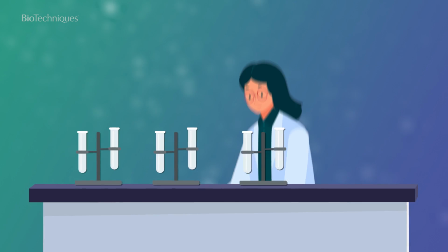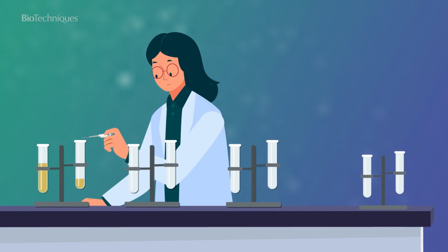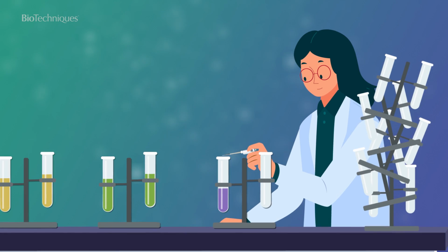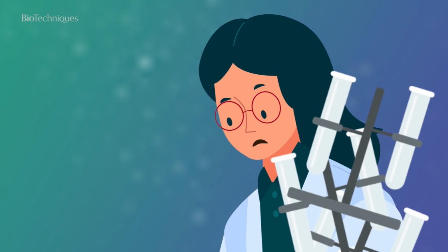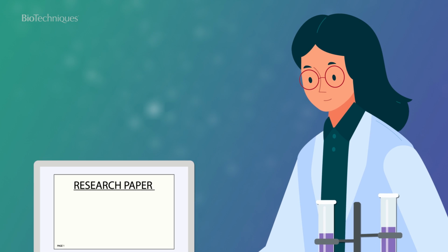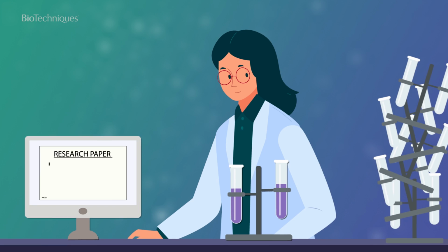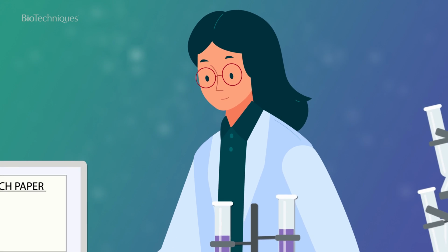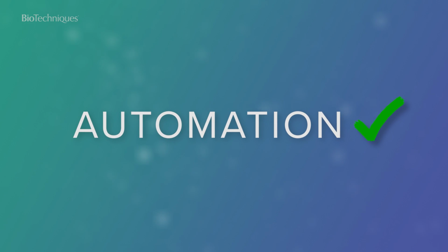So, should you automate your lab? There are two main reasons to automate your lab. The first is a labour shortfall, when the increase of labour to keep up with the demand of repetitive tasks reduces what is achievable by a research or application lab. The second is because of technical challenges, when having limited hands that can replicate a complex assay stagnates potential growth and limits or bottlenecks technical laboratory expertise. In these situations, an automated processing infrastructure would be beneficial to your lab.